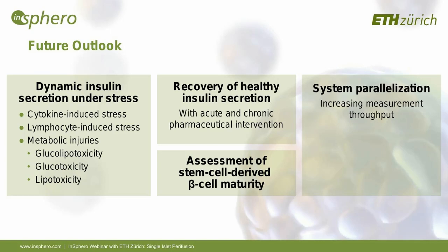And we would like to then try recovery of these impaired dynamic insulin secretion by using acute and chronic pharmaceutical intervention.